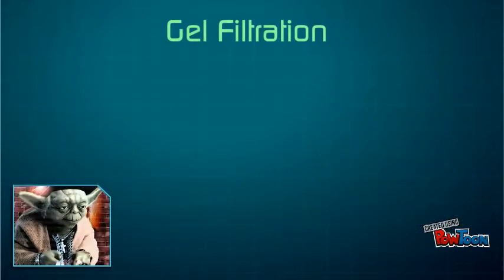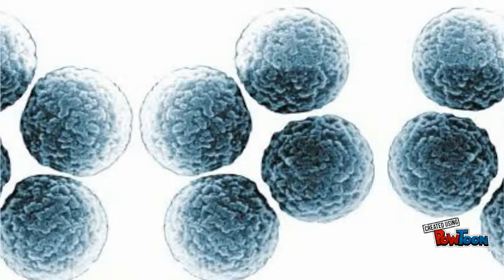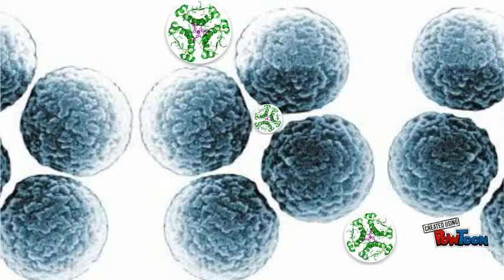Right, let's start with gel filtration, aka size exclusion. Known as the simplest form of column chromatography, this column takes advantage of a molecule's size to separate it from others. A column works by allowing a solution of molecules through a gel which contains small beads. These beads have properties that allow them to separate molecules based on their physical and chemical traits.